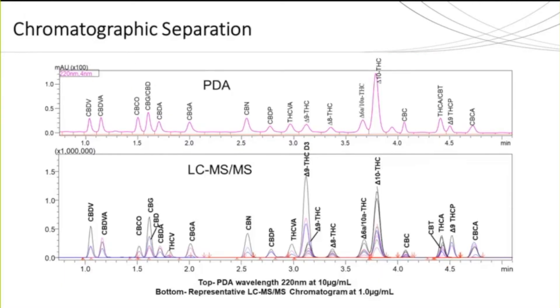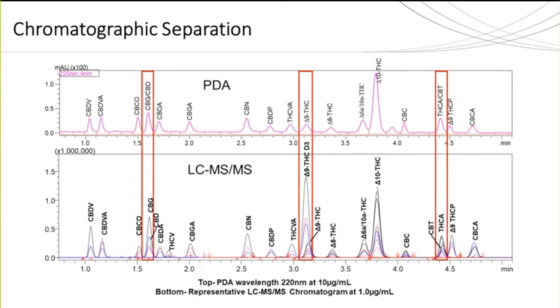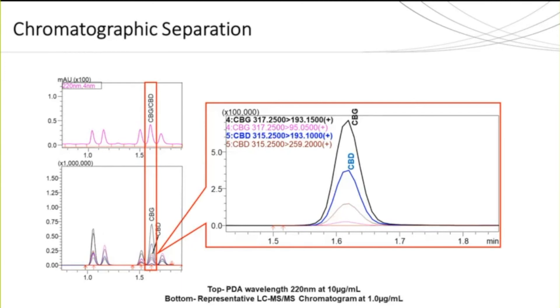Just like with the single quad, individually identifying and quantifying each isomer as well as the other cannabinoids present in our samples is needed. The top chromatogram is from the PDA at 220 nanometers; the bottom is from the triple quad. Multiple MRM traces can be seen for each cannabinoid, and each analyte consists of at least one quantifier transition as well as two to four qualifier transitions. The triple quad achieved complete separation and identification for all 20 cannabinoids and THC isomers present, but the PDA did not. The three highlighted areas demonstrate where two analytes could be identified using analyte-specific MRM transitions without requiring complete baseline separation. For example, CBG and CBD co-elute in the PDA chromatogram, but the ability to use different MRM transitions specific to each analyte means individual quantitation can still be completed.